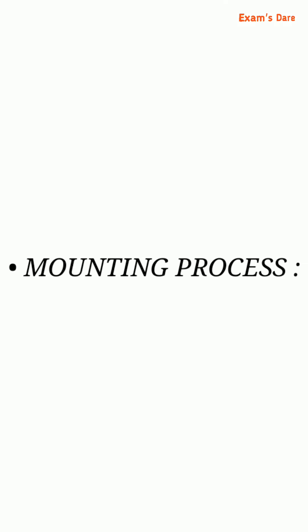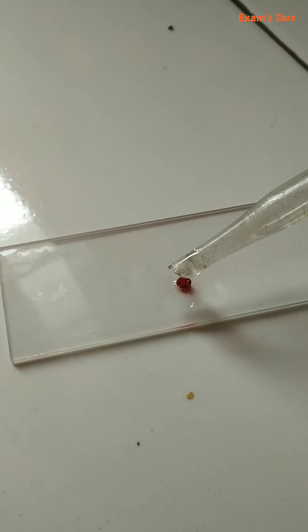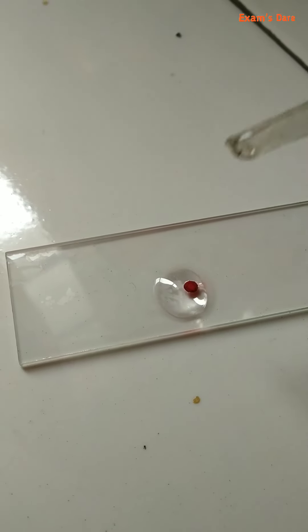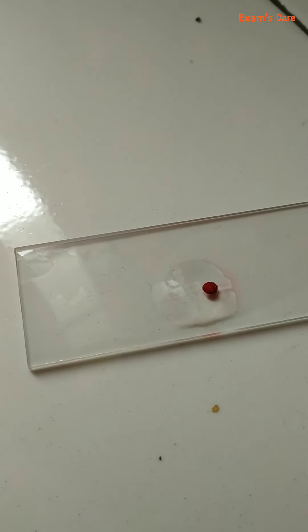Now the next process is mounting. Transfer the section onto a clean micro slide. Add one or two drops of glycerin. Take a clean cover slip and put it on the slide.